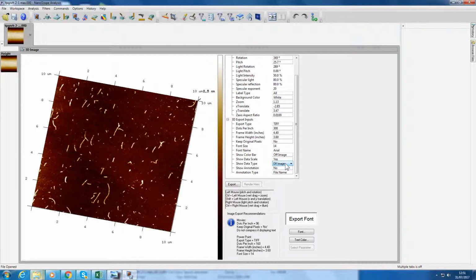So that's basically how to get a simple three-dimensional image into TIFF format from the raw data file format. There are some other things which I'll show you in some other videos, but that's actually the basic one which should get you started. Okay, thanks for listening.